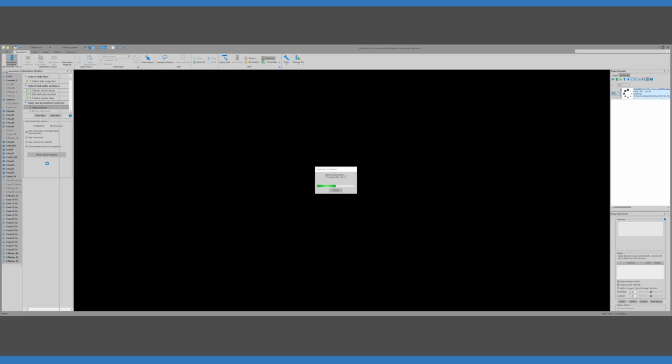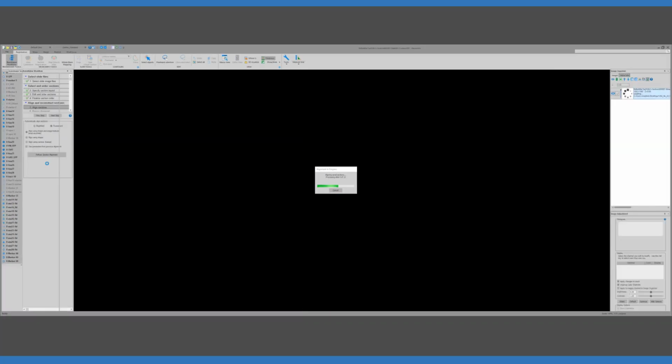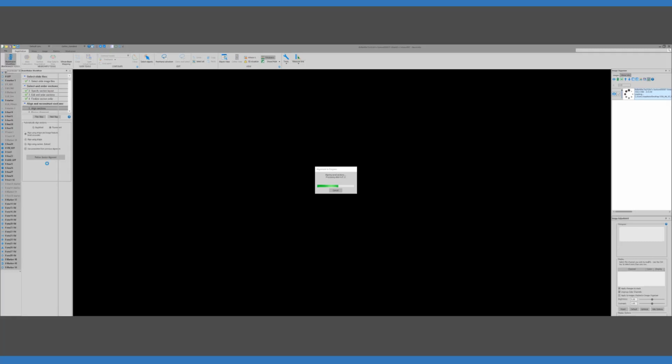And what we're evaluating is translation and rotation to get those components to align. And then also we're looking at the flipping as well. So you remember that there's the injection site and the traced projections going through the brain. That sort of thing can be used, that's a big cue to being able to figure out whether there's flipping in this particular case.